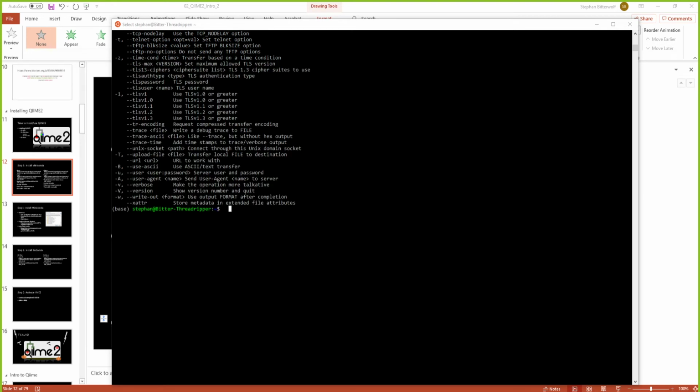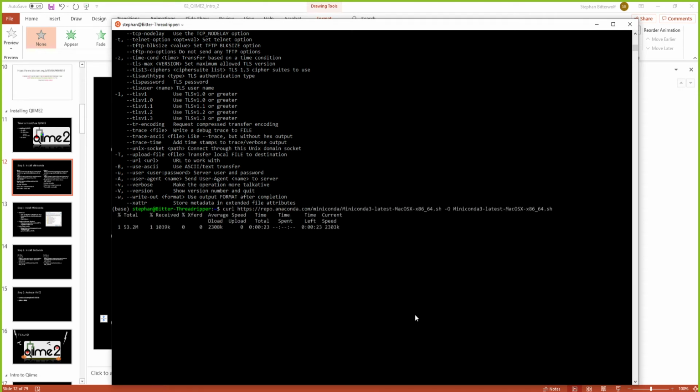I'm going to copy this command. Let's see if I get the same error. Okay. And I think it is because this might be in the wrong location.